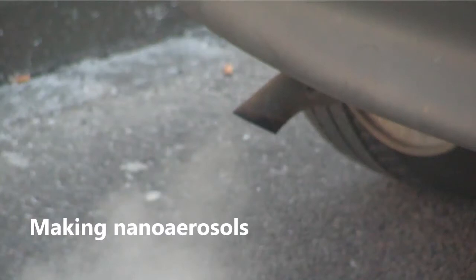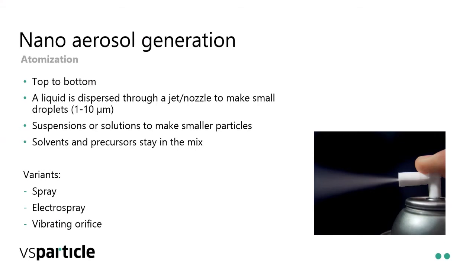So how do we make nanoaerosols? Well, the first method is atomization, and there's many variants of that. It's a top-to-bottom approach. You take a liquid and you can disperse it through a jet or a nozzle or anything like a sharp edge. And this liquid is shot over that at a high pressure and is quickly dispersed into tiny, tiny droplets. They tend to be about a few microns in size.